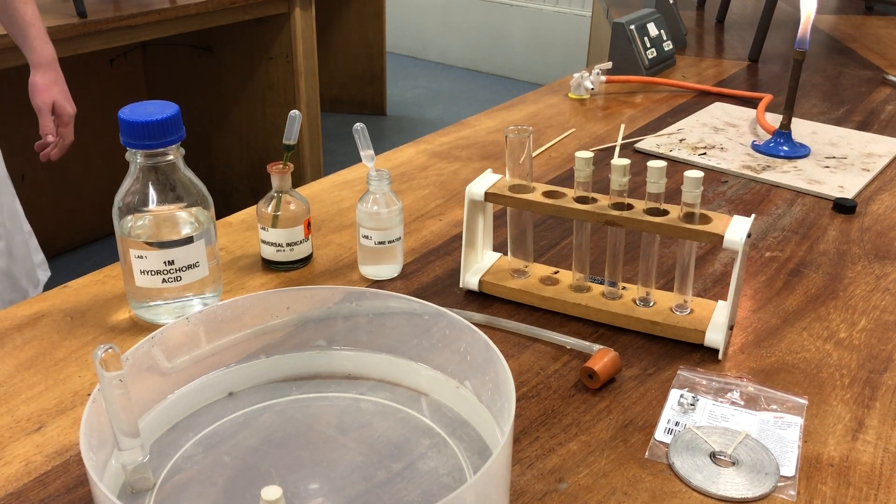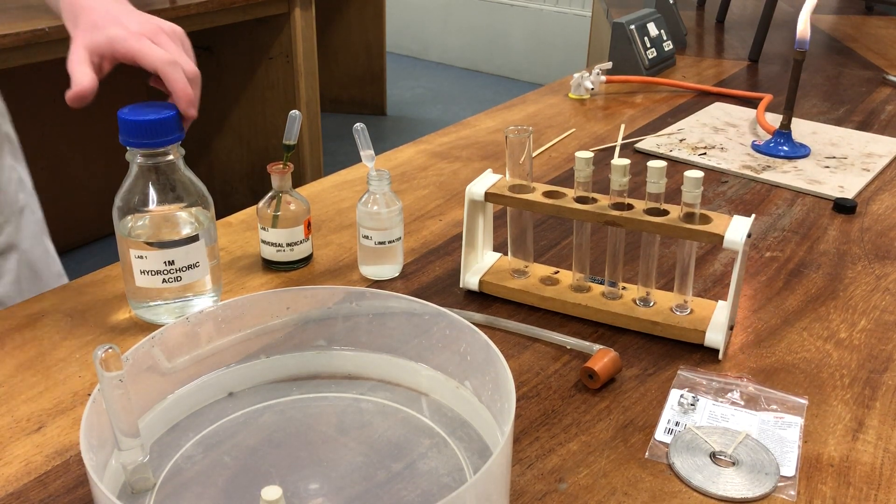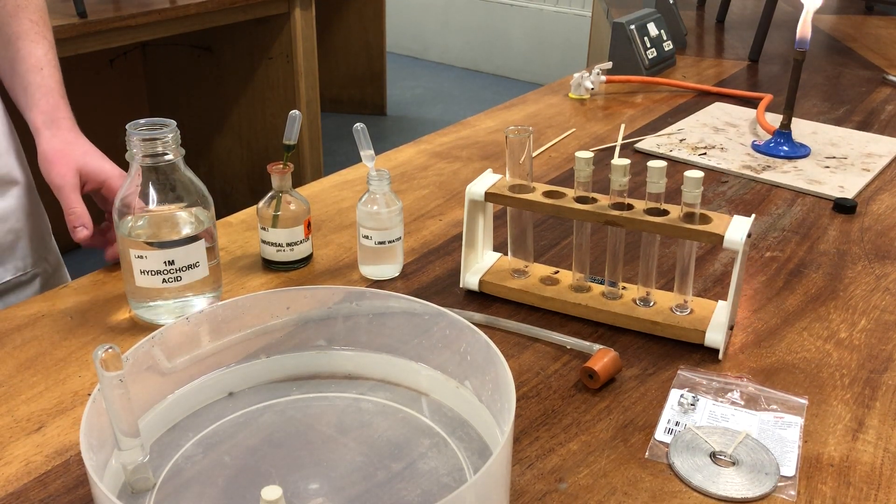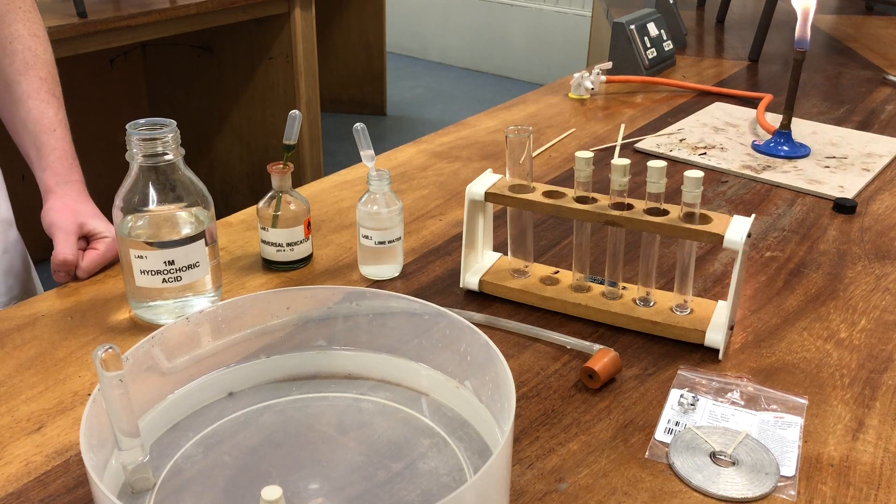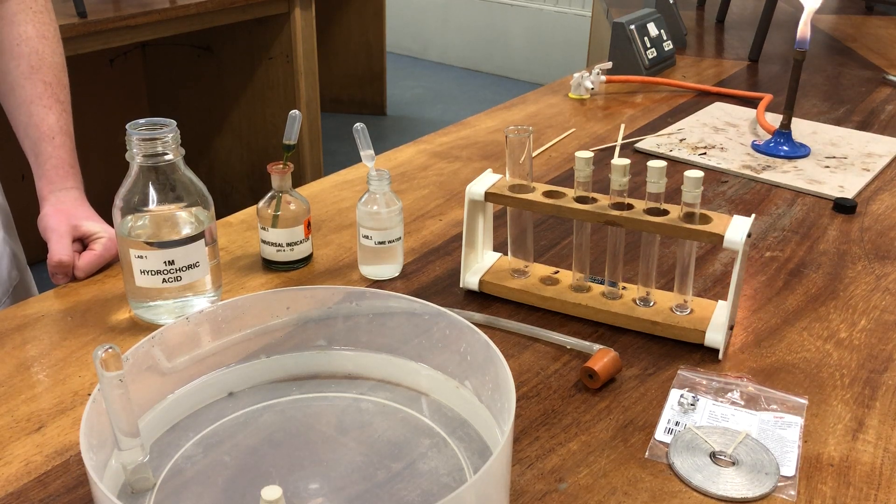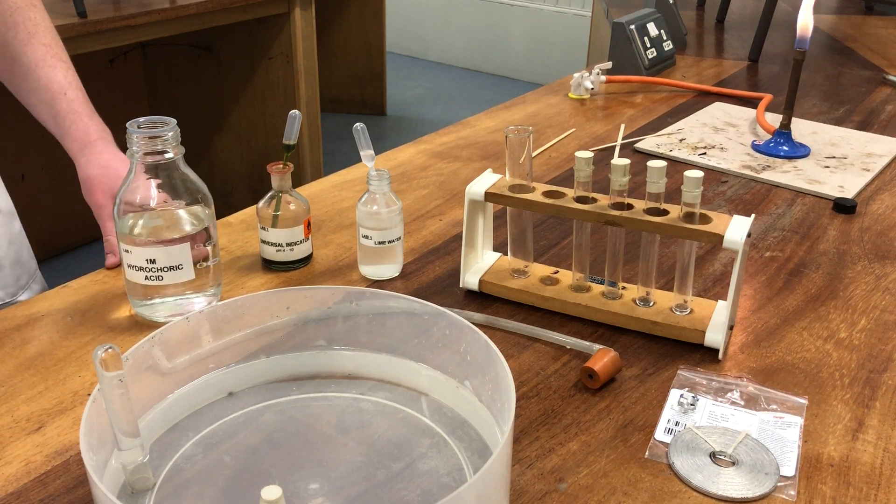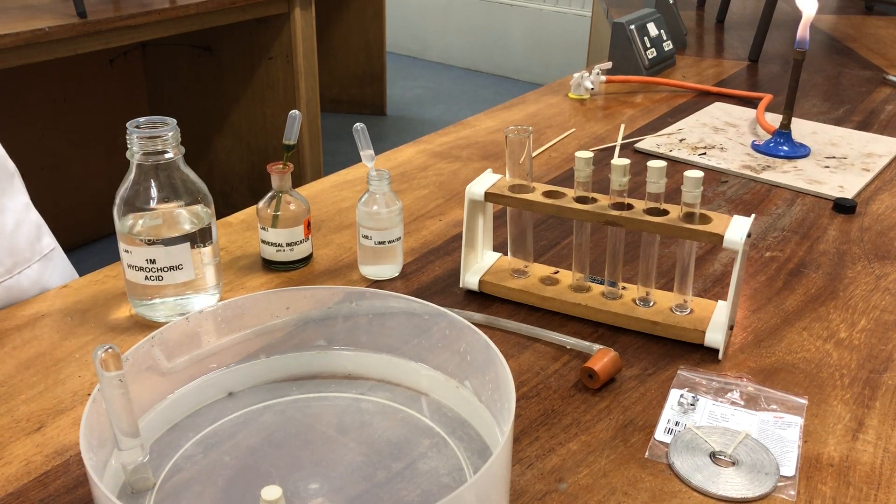We can make hydrogen gas by reacting a reactive metal such as magnesium, which we'll use here today, or zinc, or maybe calcium as well. We react it with hydrochloric acid, one molar hydrochloric acid that we will react together.